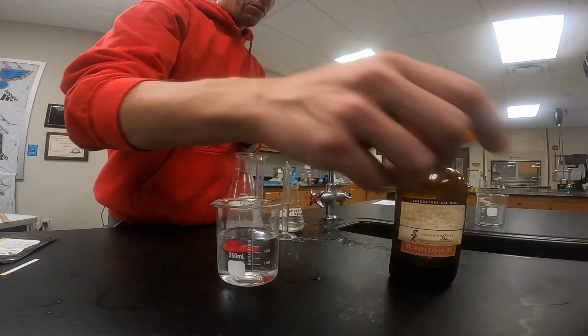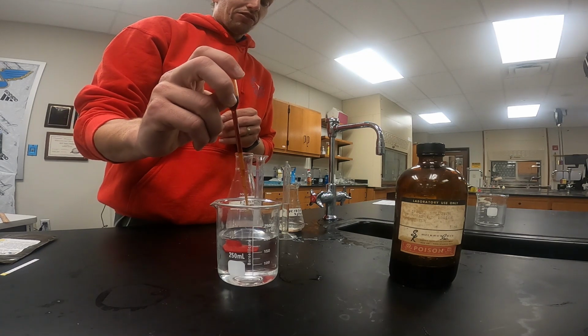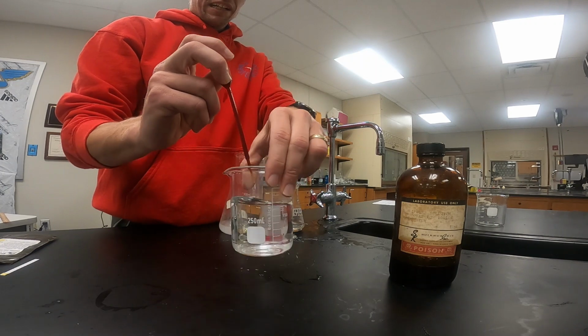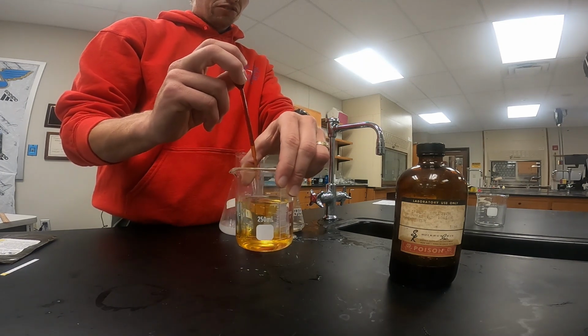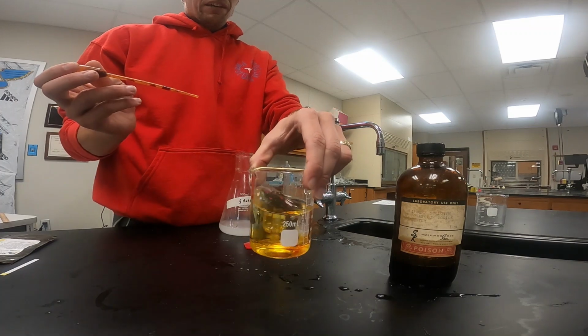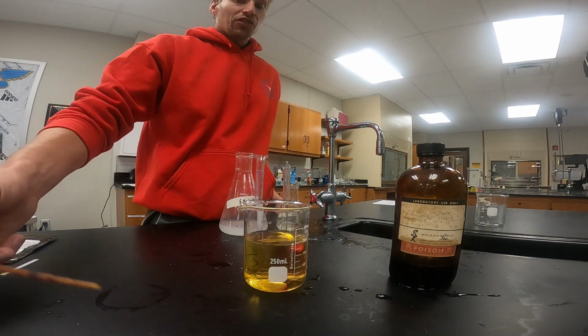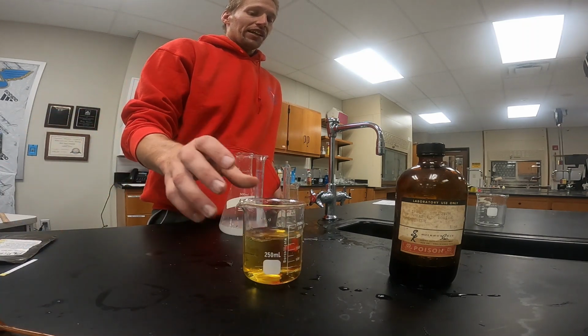Next, inside that beaker, we're going to place a few drops of iodine. As we add the iodine, we'll swirl it around. We want about 10 total drops. I'll just put a squirt or 2 in, and it gives us this dark yellow color. So that's our first observation. We have 0 glucose, and we have this golden yellow color in our beaker.